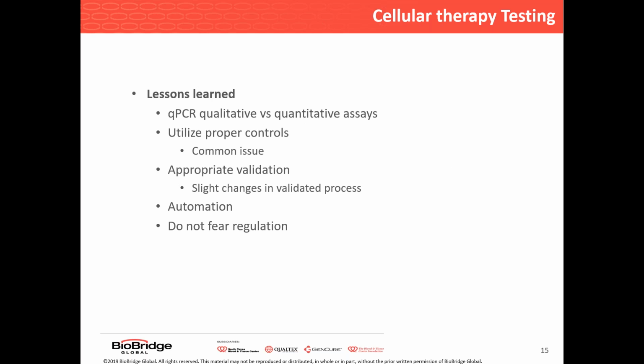Another big thing to think about are really these PCR assays. Most of them are listed, and most of the current testing laboratories are really using quantitative assays. And that's fine. The problem I have with it is you're not really making a call based on the quantity. Really what you're more interested in is: is there a virus there or not? It's really more of a yes or no safety issue, which is very similar to what we do in donor screening.